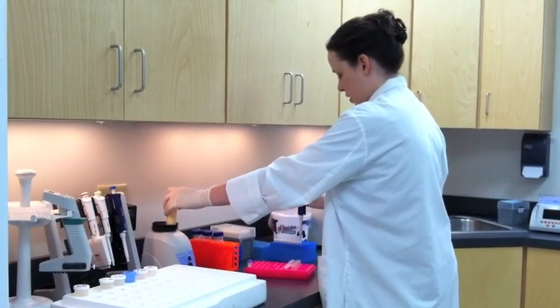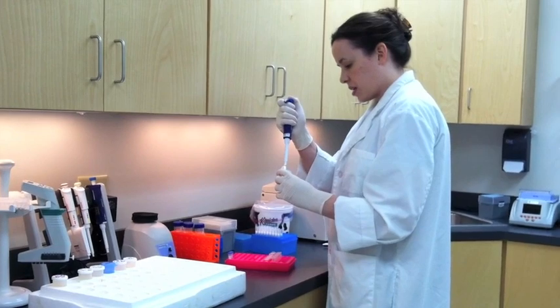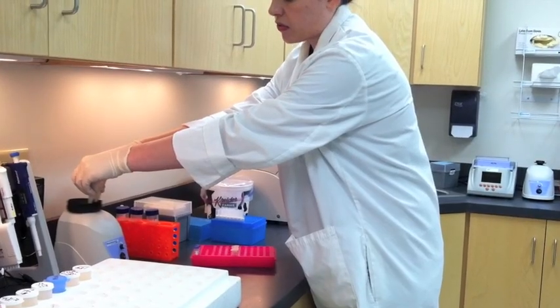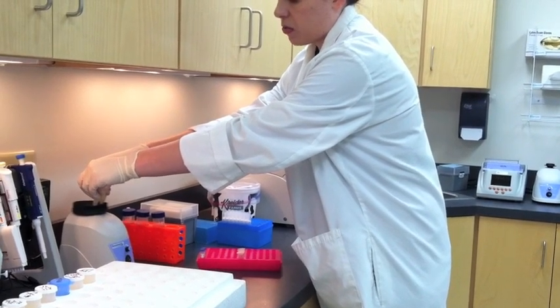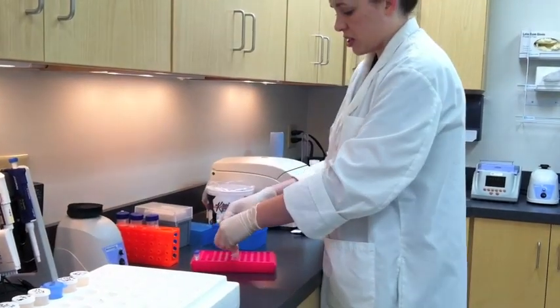Each sample goes in its own tube, so you're keeping them separate throughout the extraction process. After mixing them, they will be incubated for 5 minutes at 55 degrees Celsius.